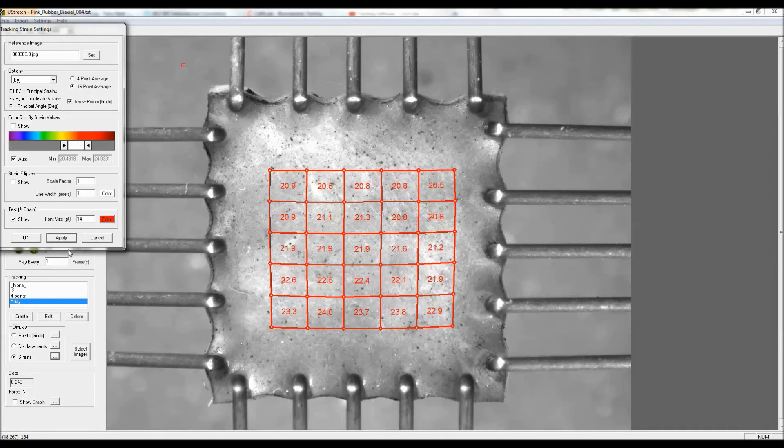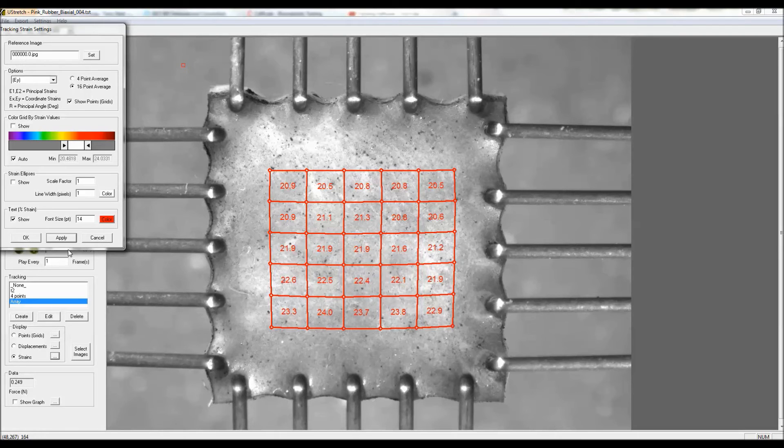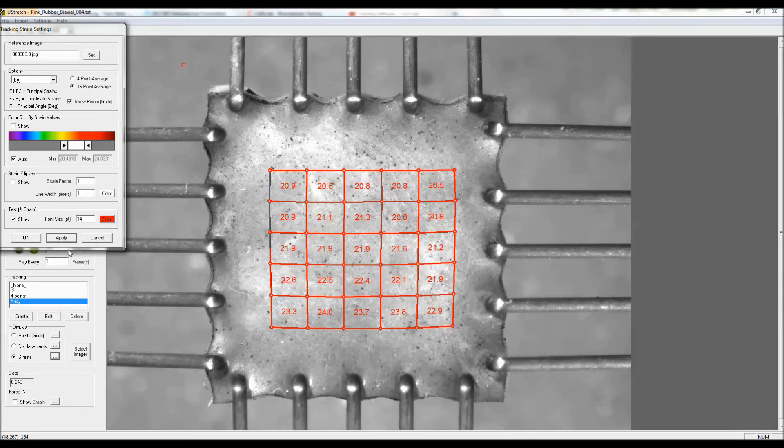That's really one of the main purposes of doing this kind of tracking, is to be able to verify that the strains based on the grip motion are in fact the strains that are seen by the material.